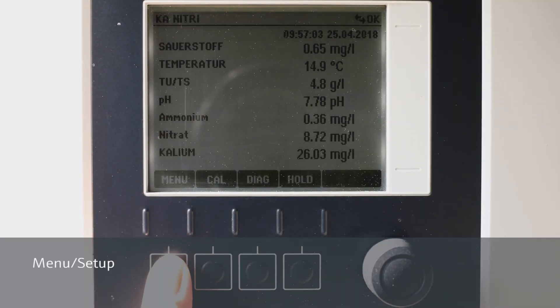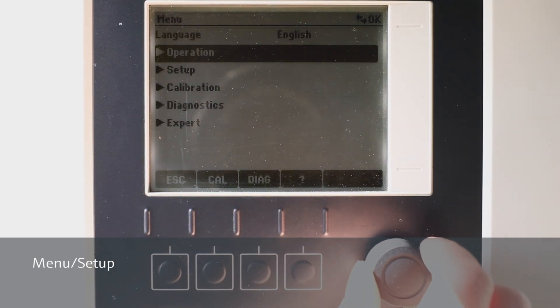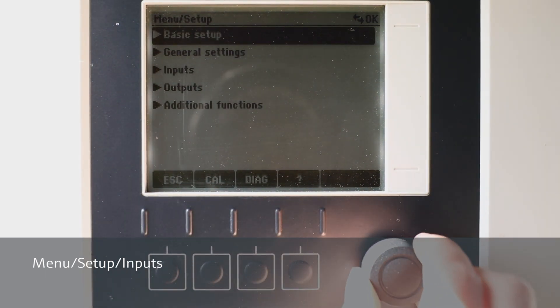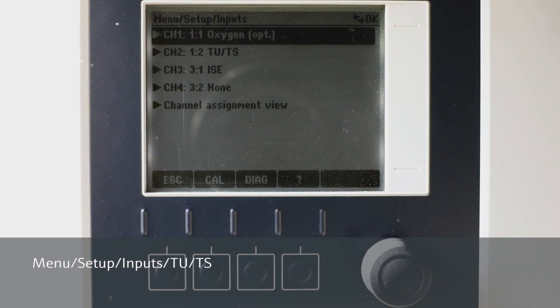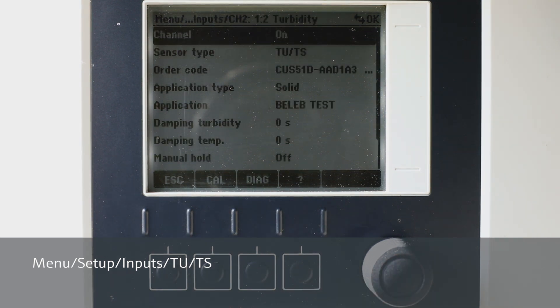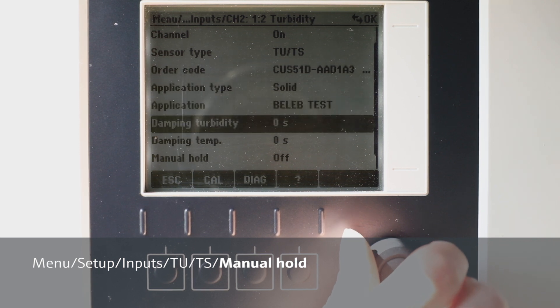Before we start with the cleaning, we need to set the measurement on hold so the measurement outputs are not affected by the cleaning. We go to Menu, Setup, Inputs, and select the sensor channel, then we go to Manual Hold and set it to ON.